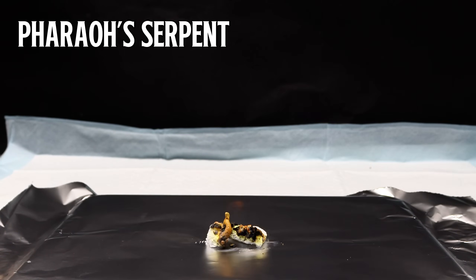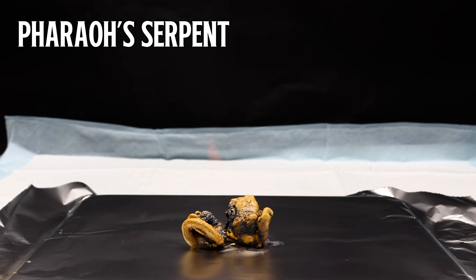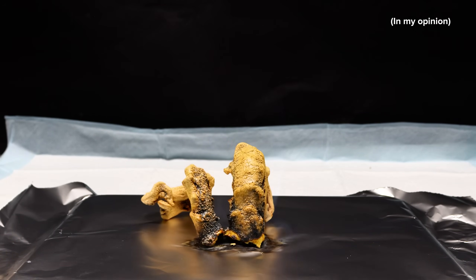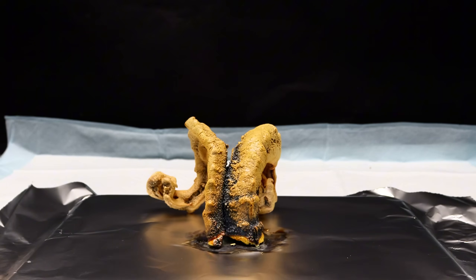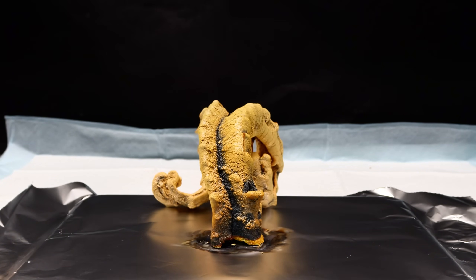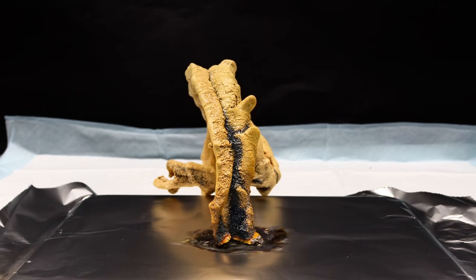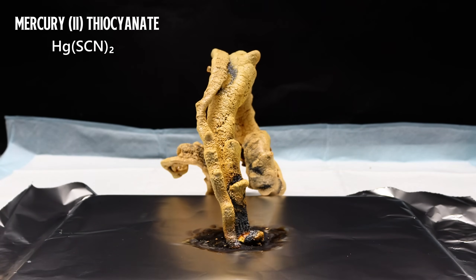This bizarre chemical reaction is called the pharaoh's serpent, and it's by far the most dangerous, but also the coolest, of all the different carbon snakes. Unlike most other carbon snake demos that use sucrose along with sulfuric acid or fire, the pharaoh's serpent uses the incredibly toxic mercury-2-thiocyanate.